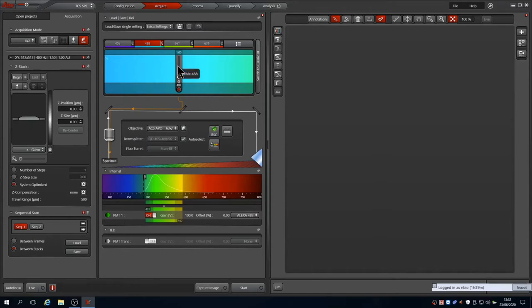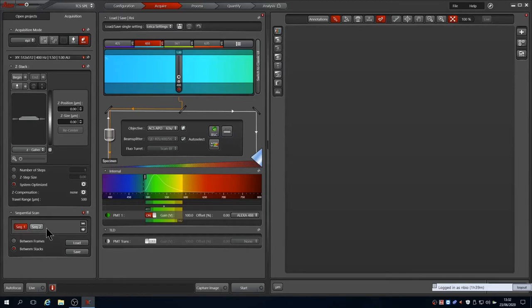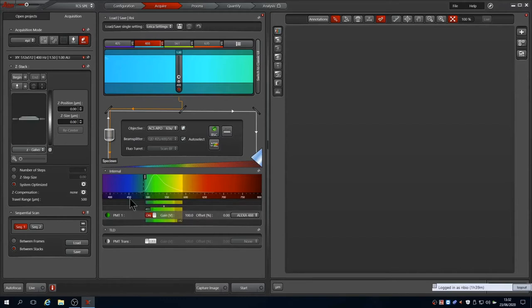Now we can see that the 488 laser is on and defaulted to 1% power. On the left there is now a sequential scan control box showing sequences 1 and 2. Here we have Alexa 488 on sequence 1, with its respective 488 laser and green emission band pass. Alexa 594 is on sequence 2.